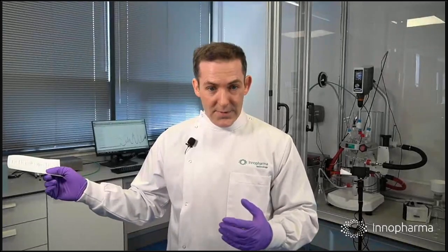There is even an application of NIR, for example, analysis of blend or content uniformity, where the only important factor is the trend.